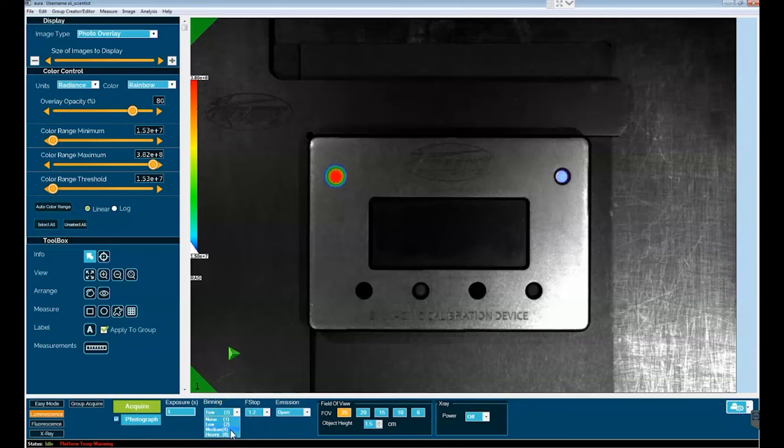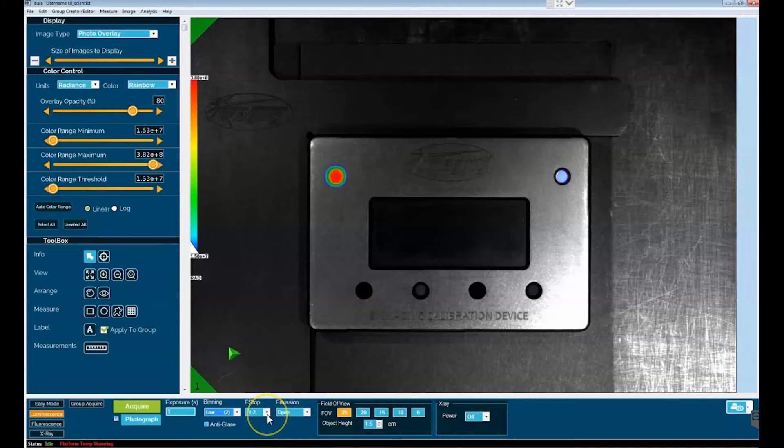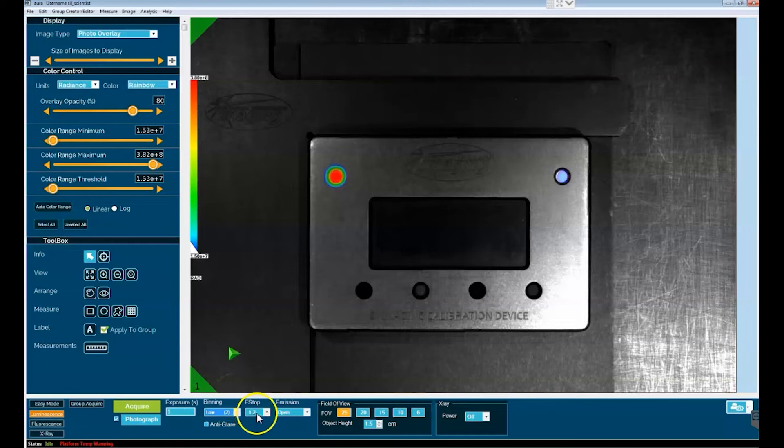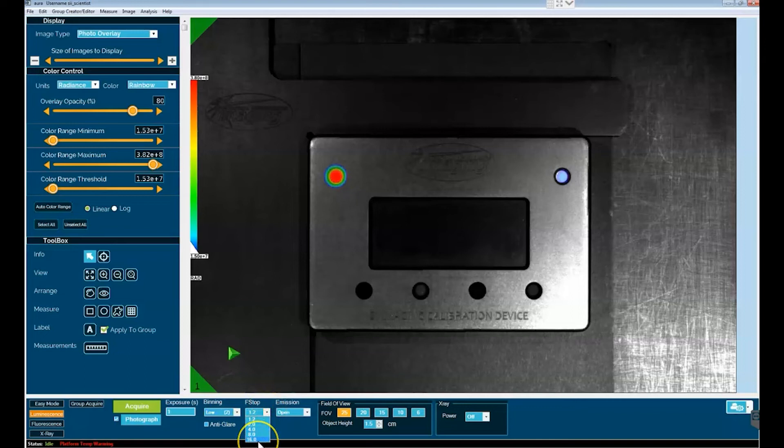For f-stop or the size of the opening of the aperture of the camera system, the default setting is 1.2 - that's as wide open as the aperture will get. It does go down in diameter to the narrowest diameter designated by the f-stop value of 16, which is for systems where you have very bright sources of light.